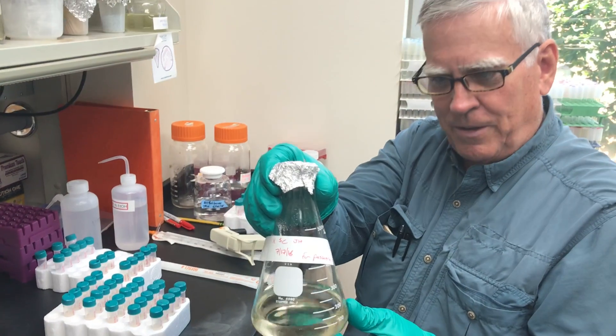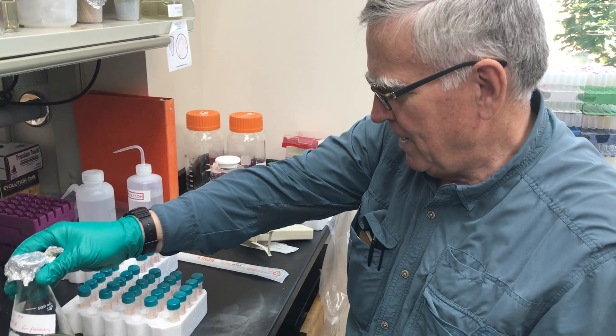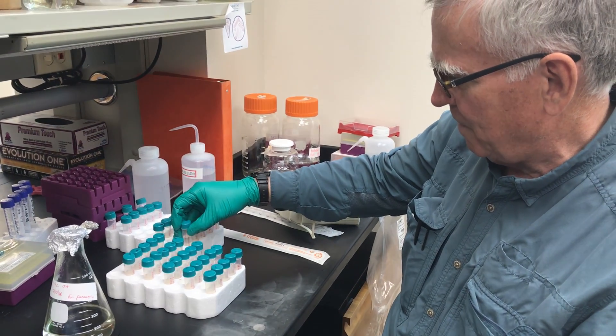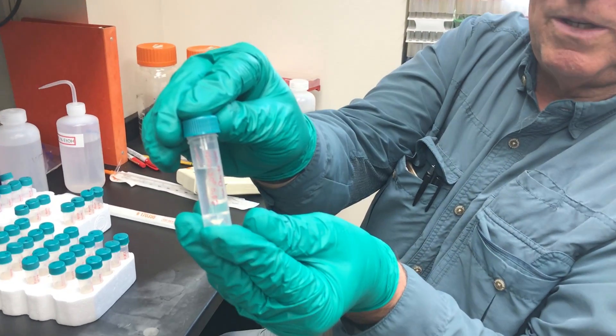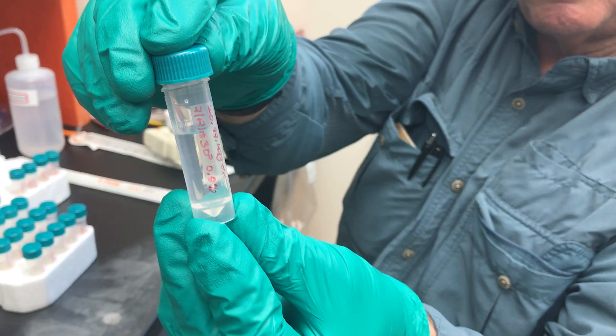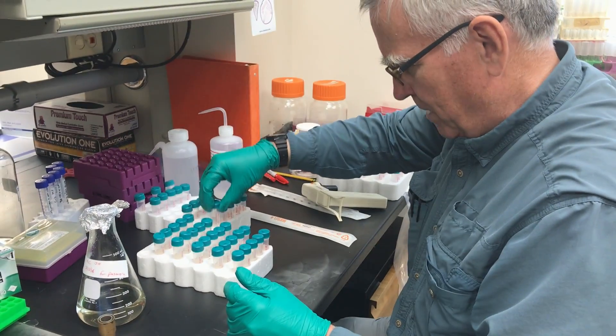We have the solution here that I'm going to be transferring into these tiny little tubes. We're going to do five — I have taken others and filled them already. These are five milliliter tubes, and as you can see, this is just the solution. We'll later put the yeast into it that we hope will grow — yeast from California, by the way.